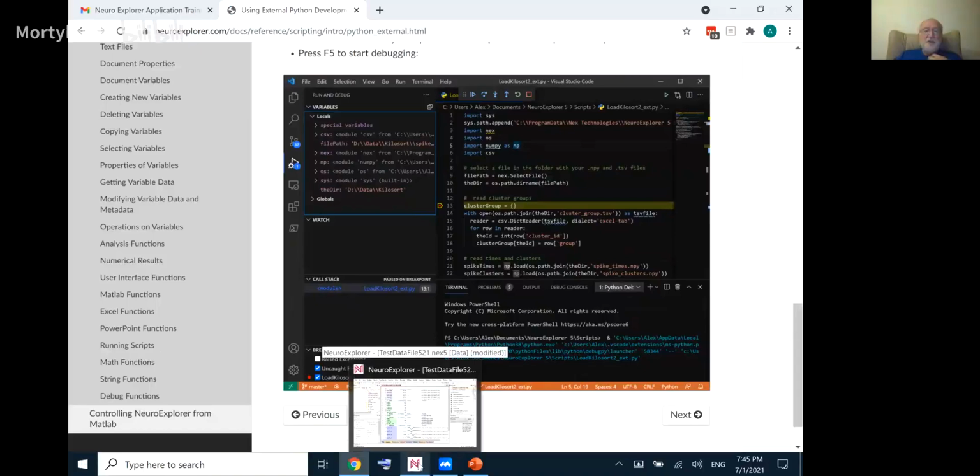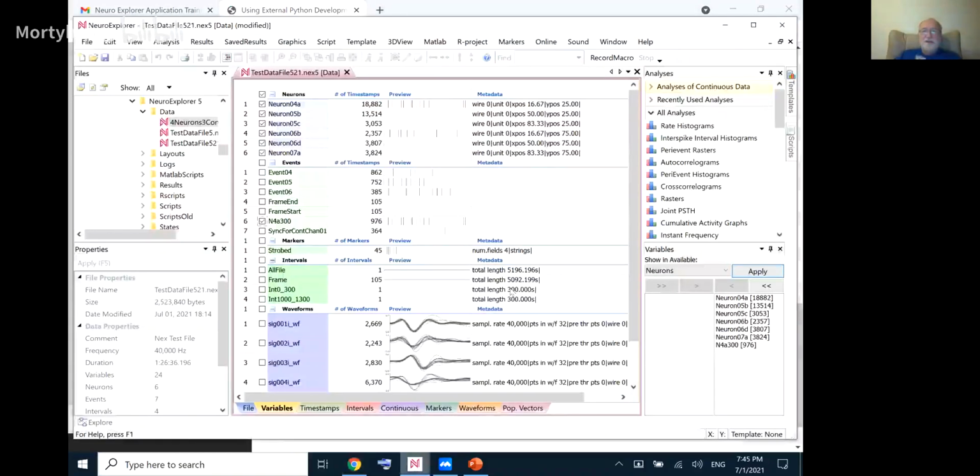Okay. So if you need help with scripting, just send me an email. I'll be glad to help. I love Python. I'm doing a lot of things in Python now. Especially since all the documentation is Python based. It's wonderful.